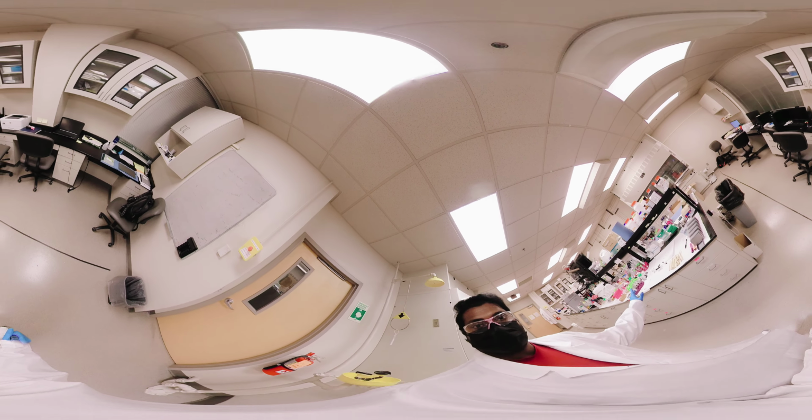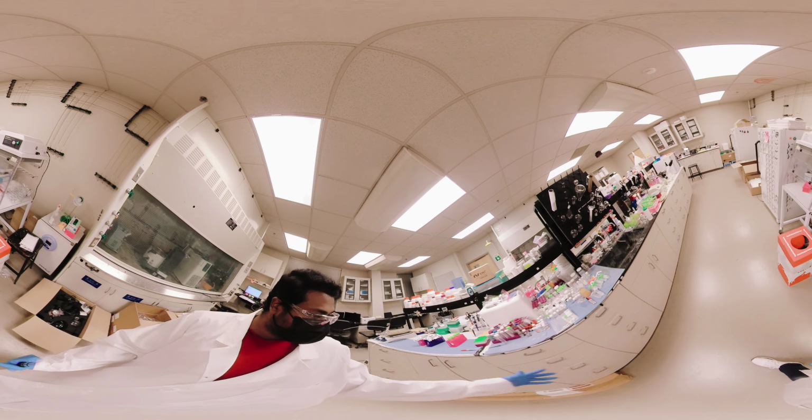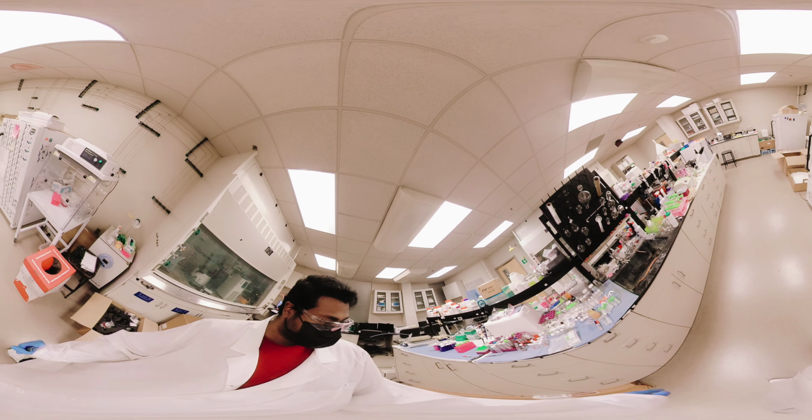This is another hood. In this hood we have an evaporator. What does this evaporator do? It evaporates whatever solvent you are using for your experiments. On this side we also have our bench tops. Each bench top has its pipettes and all the other instruments. We have a sink over here.